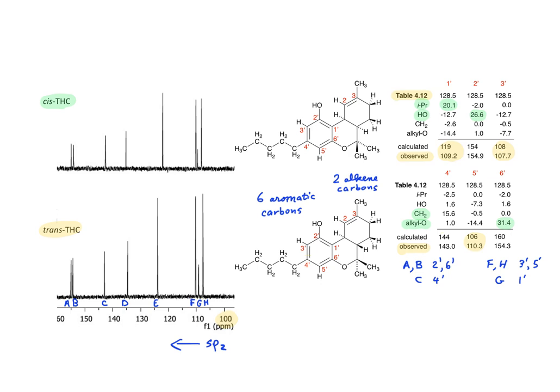We still need to assign D and E. However, D would fit for carbon 3 since it's a weaker signal without NOE, whereas E fits for carbon 2, which is bonded to a hydrogen. Thus, with HMQC alone, we already have good candidates for 8 of the carbons and unambiguous assignments for 4 out of those 8 carbons.